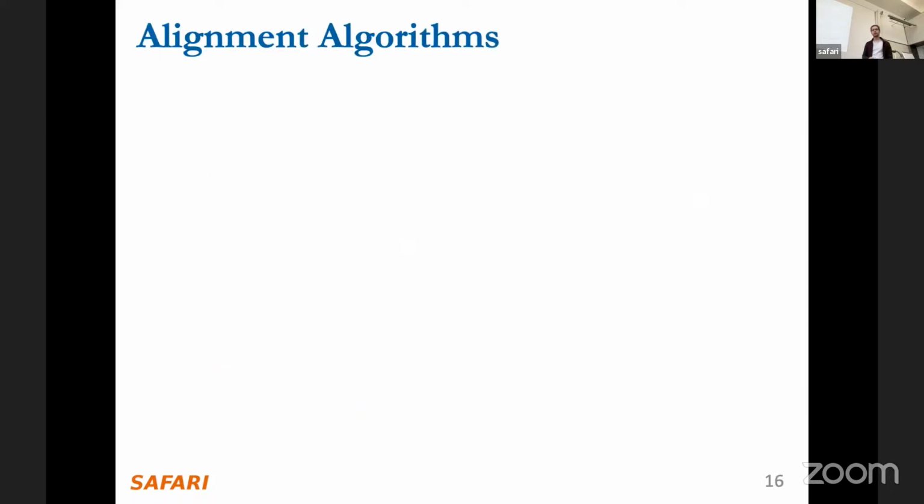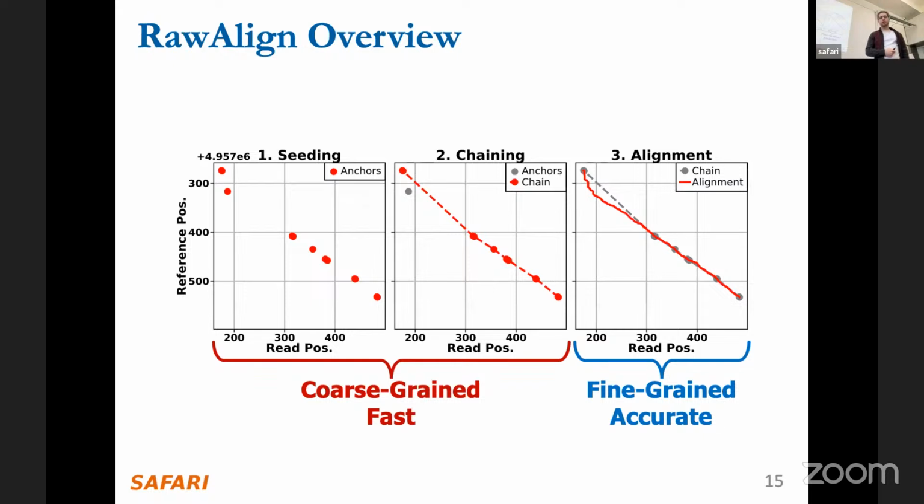Yeah, please. So I thought that the sequencer just continuously reads the entire molecule that it has. But in, for example, the first graph, that's not the case. How does it decide where it does the read in the molecule?